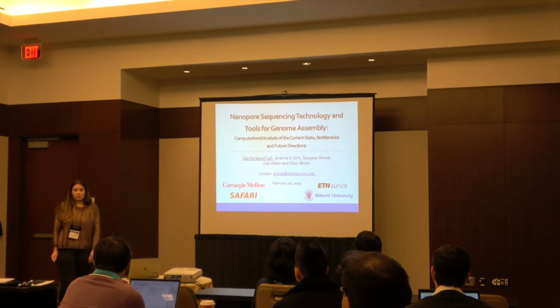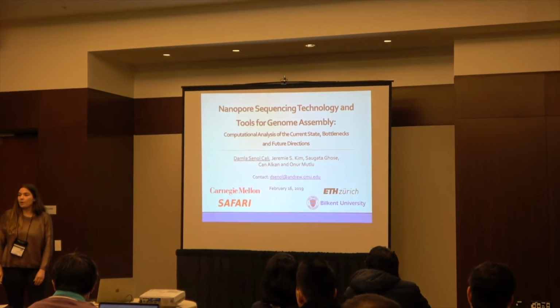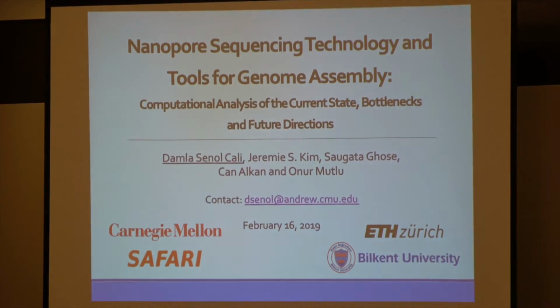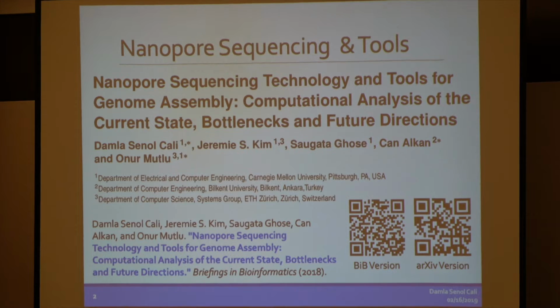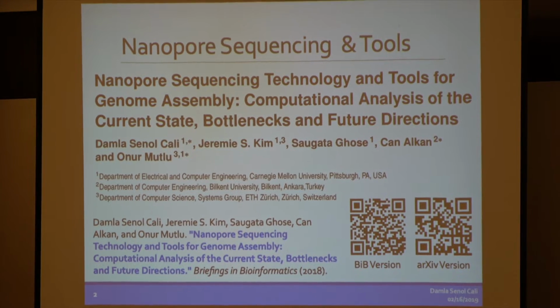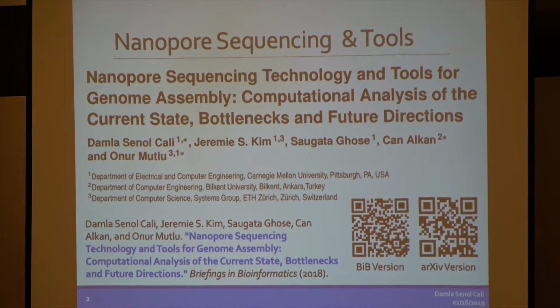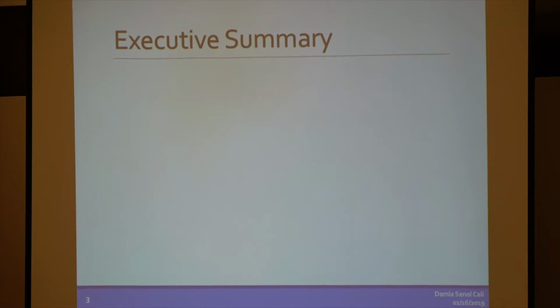I'm Damla, and today I will be talking about our paper on Nanopore Sequencing Technology and Tools for Genome Assembly. And here are the QR codes for our paper. We published in Briefings in Bioinformatics, but we also have the archive version if you are interested.